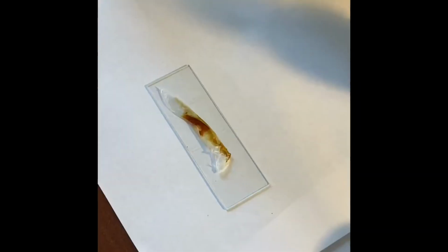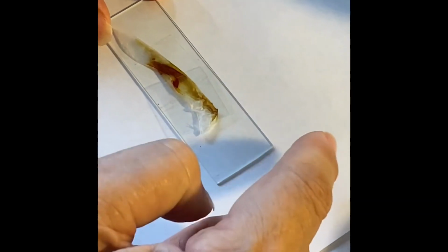I'm going to add a drop of Lugol's to dye the nucleus, which is the brain of the cell. I'm going to put a cover slip over it and press down on the cover slip, and you can move that onion membrane.